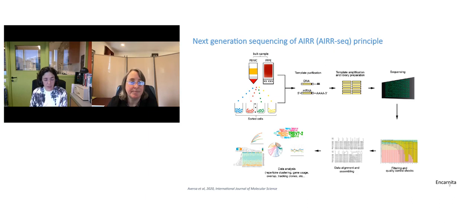Because those TCRs and BCRs are not highly expressed, it is necessary to amplify the template by focusing on the TCR and/or the BCR rearrangement. Once you have this amplification, you can prepare what we call libraries, which is the collection of the amplified rearrangements that you obtained in your samples, and then you can load this into a sequencer for sequencing.